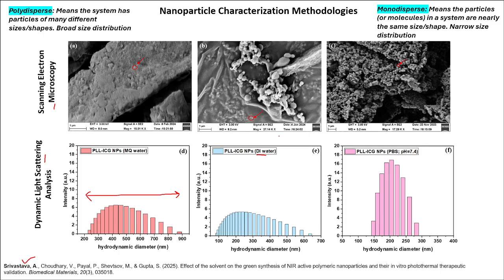But when we changed the solvent, it improved a little bit, like 100 to 600. The range decreased. But when we dissolved our nanoparticles in PBS, we found that the best colloidal stability was achieved. This is a small range in comparison to these two. In addition, you can also see in this image that this one is so much aggregated, this is comparatively a little less aggregated than this one, but this one shows monodisperse particles.